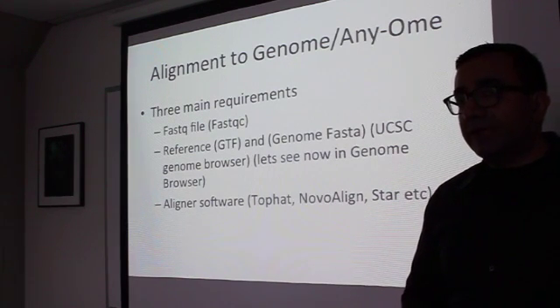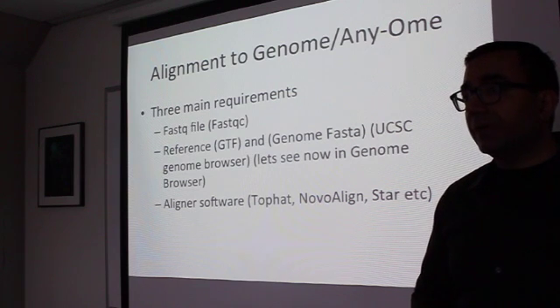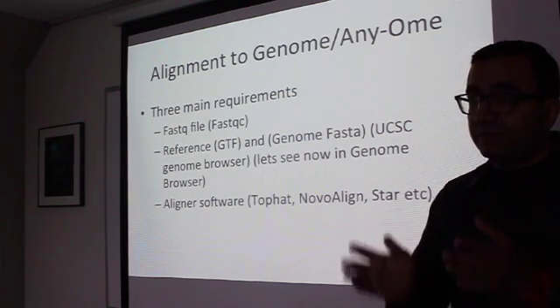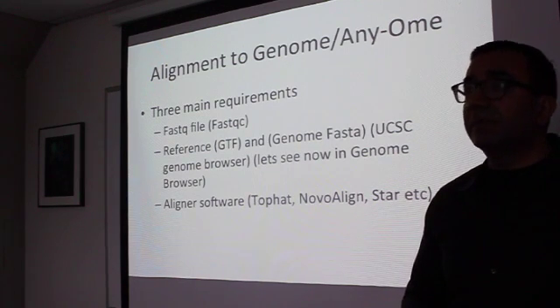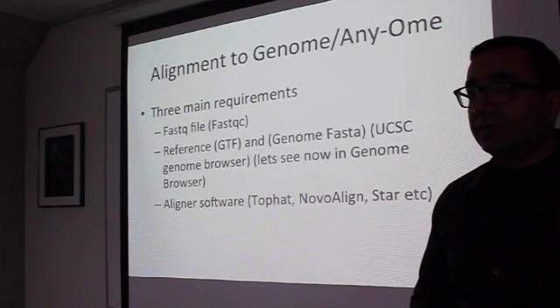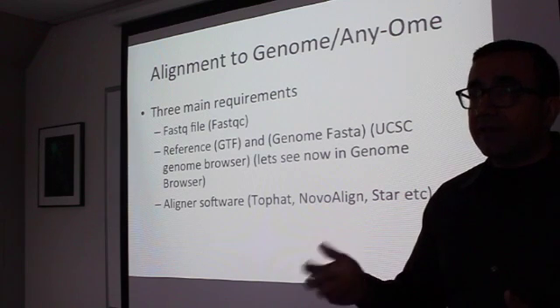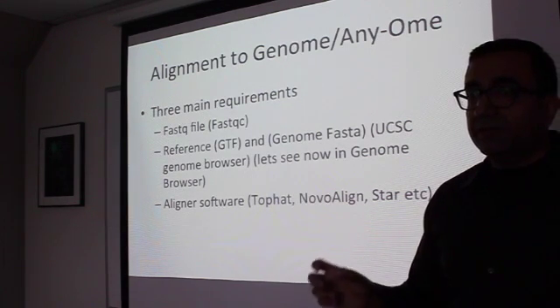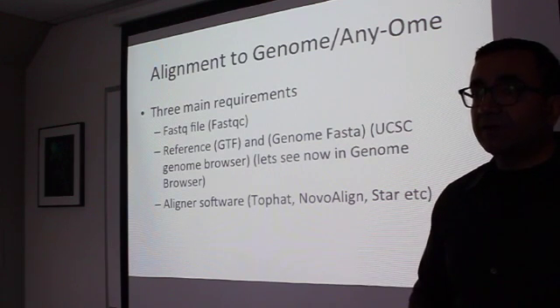There are tools like FastX Clipper from the Hannon lab, which you can use to chop off some of those first few sequences. Could be adapter contamination or whatever it is. And FastX adapter search also helps you come up with what the possible contaminants are.